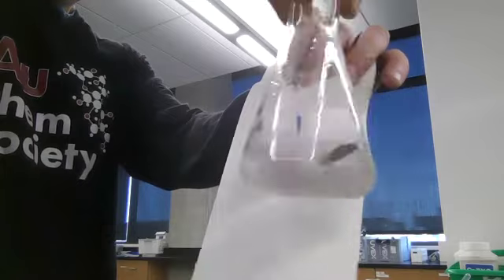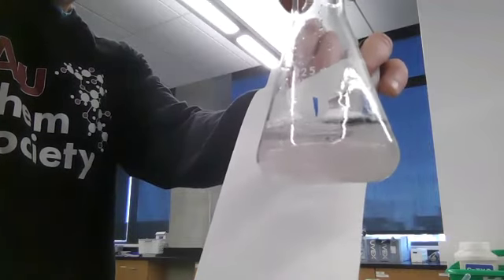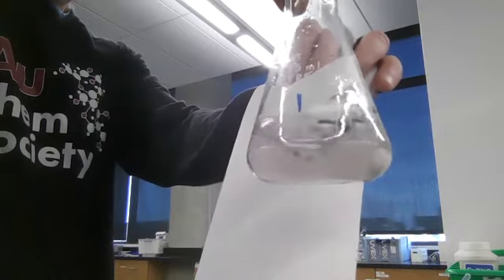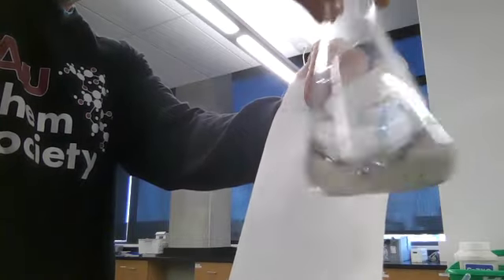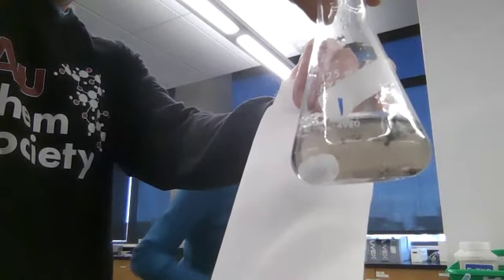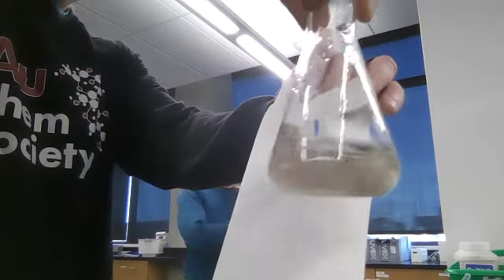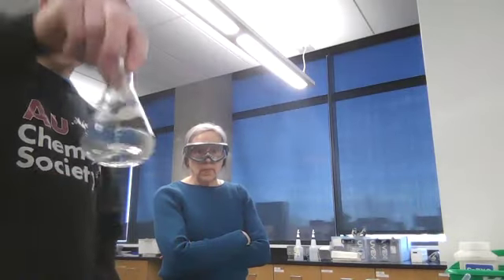I am starting to see it. See, yeah, little purple. That would be your timing stop, when you first notice that tint. Now you can see it really turning brown. See that? Nature's still functioning in this crisis. And there we go. Nice and brown. It was purple at the beginning, and then it turned into the brown. Okay, that was a fake trial number 1.